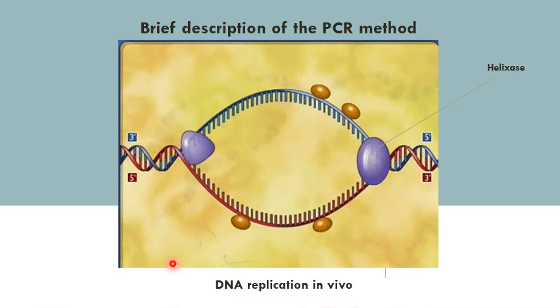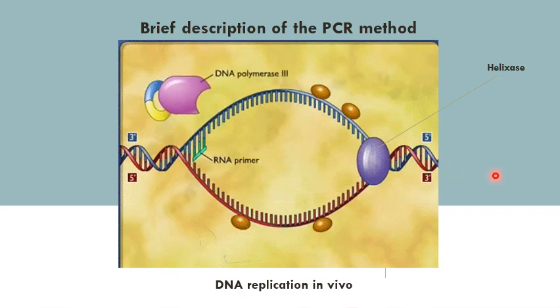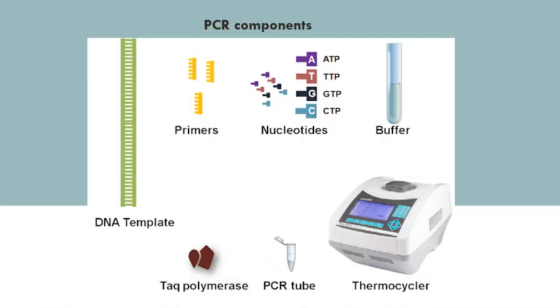This is the same concept for the PCR. Just like that, you will need primers, you will need some enzymes, you will need your template DNA, and so on. So what are the components of the PCR? As we said, you will need the DNA template, the one for our experiment, the one we already extracted in the lab, your human DNA. This is the DNA template.